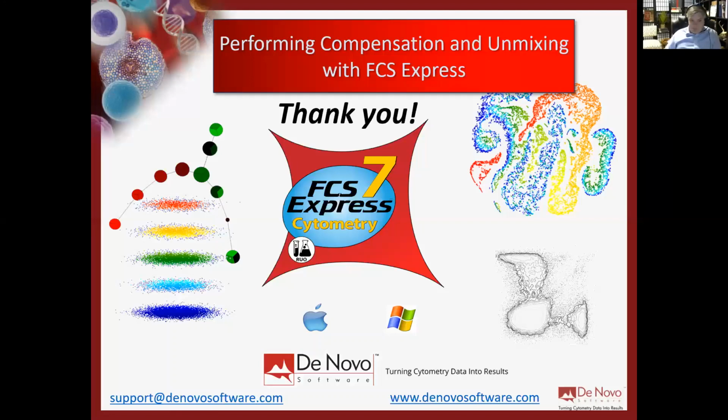And it does look like there's still no questions. Great. And let me take a second just to reiterate what Kathy said. There's really no reason to be compensating things by eye. If you're doing that, it's really the Wild West. You're making your data look like whatever you want it to be. It doesn't represent the true data or what's going on with those cells in a lot of different ways.